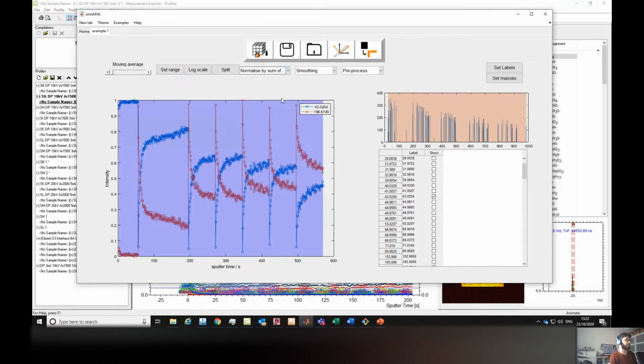So when you do this, you can see for the one without gold, that there was actually some gold there. What happened here is the polymer formulation was not designed to hold on to gold, to have the absorption, but we still did the treatment as a control. So you can see there's some residual gold on the surface that you can see in the normalization, where it's much less, right? The other ones are close to 100% on the top surface, and then it drops down. So this kind of normalization is very useful as well, especially when you're comparing.